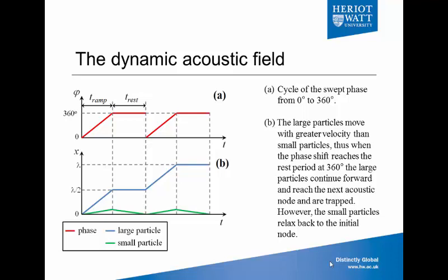So this is the dynamic acoustic field. The idea is to ramp the phase of one of the transducers and have a resting time where the particles can either move to the next node or go back to their initial node.